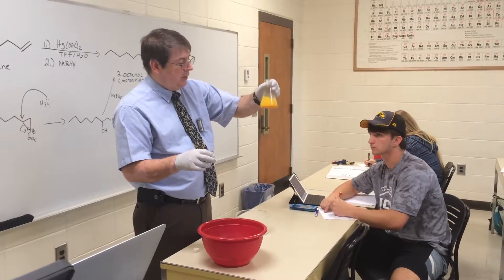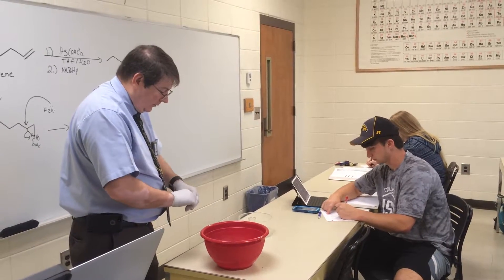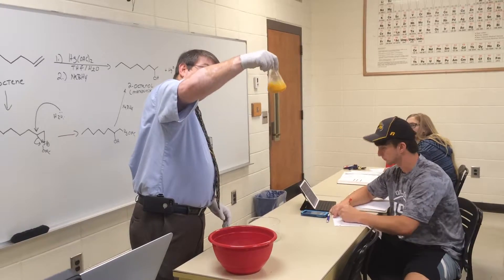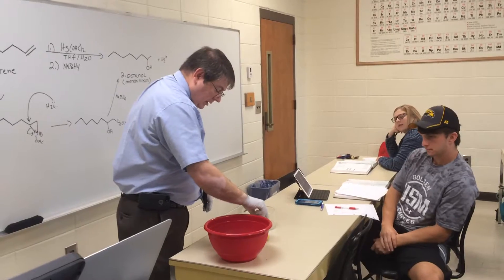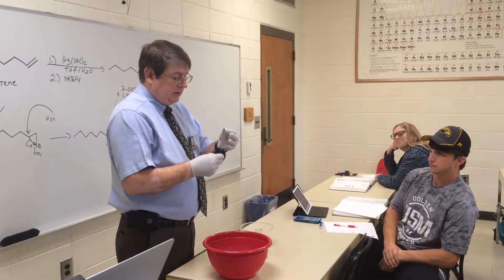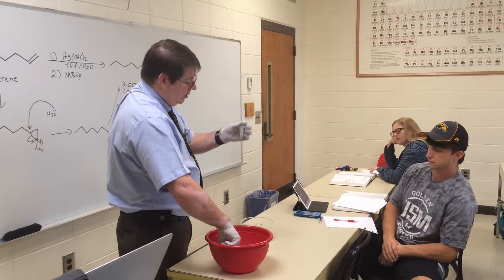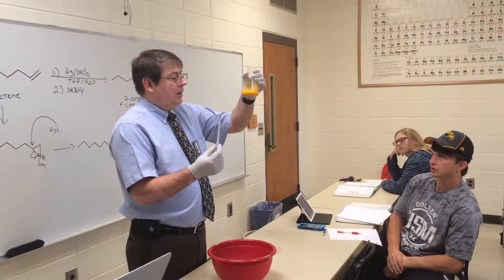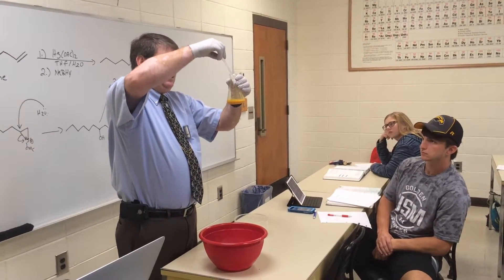That kind of looks a little yellow. So we've got a nice color change, and for those of you up front you're going to be able to smell the THF. We've got a solution of mercury — kind of a fine precipitate at this point. In this pipette I have about two grams of 1-octene. So let's watch what happens to the color as I add the 1-octene to the mercury solution — it's going to go clear.